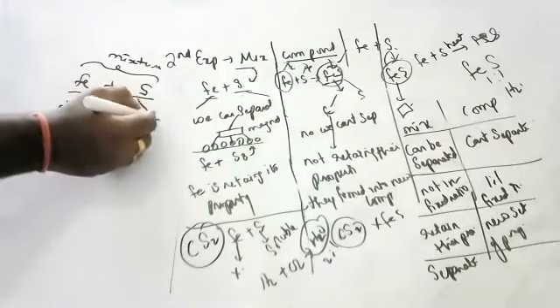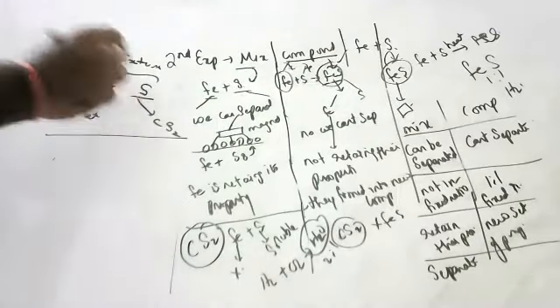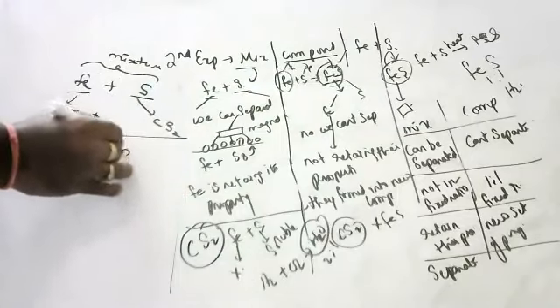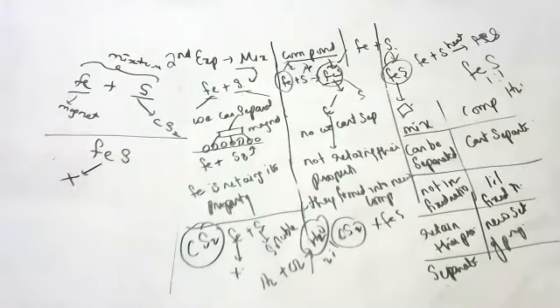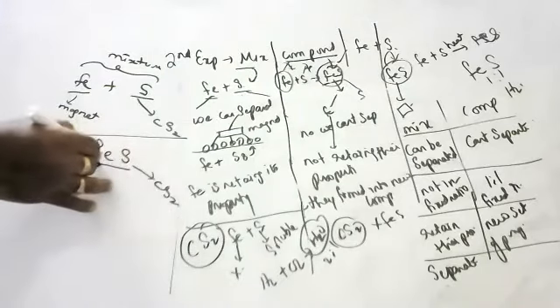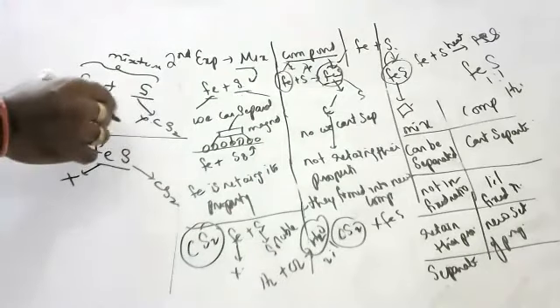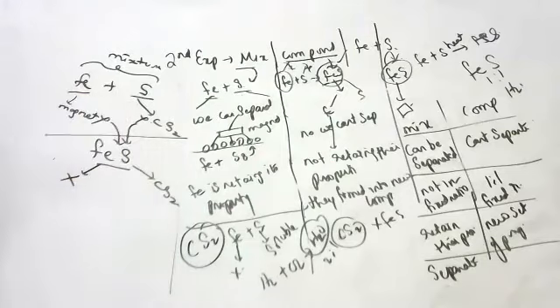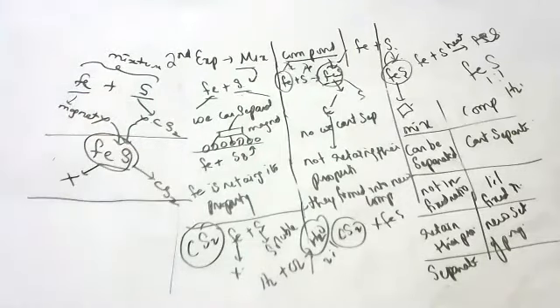Sulfur, how can you separate it? By dissolving in carbon disulfide. Whereas once they are both heated, they form a compound called iron sulfide. Now you can't separate using a magnet or carbon disulfide, and the magnetism and solubility properties change into a new set of properties. Why? Because a compound gets a new set of properties. Are you able to understand, children?